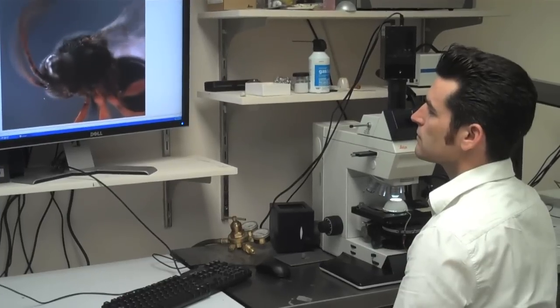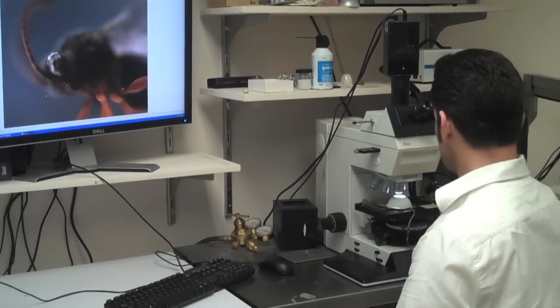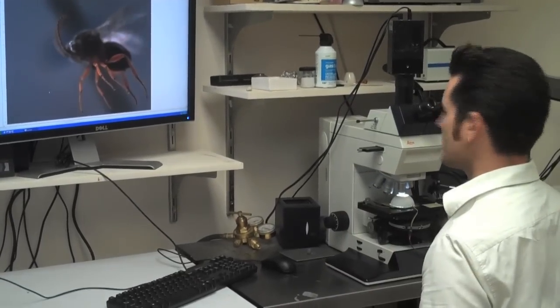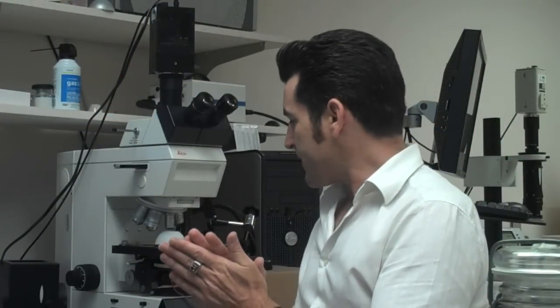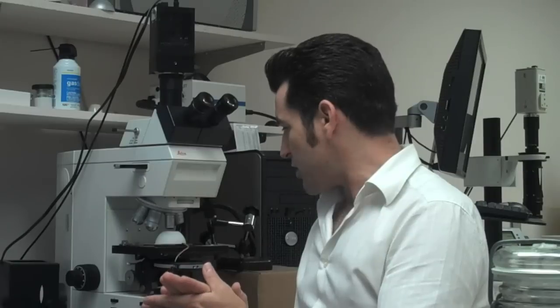These, however, are for metallurgical use where they do a lot of examination of non-prepared specimens that don't have any cover slips. Those lenses are key here.